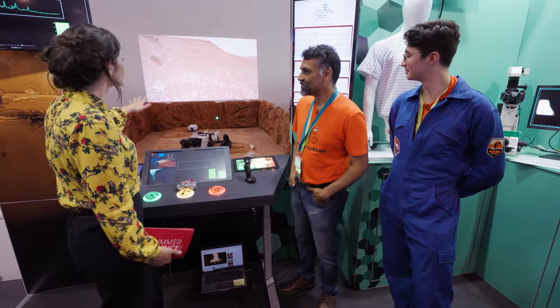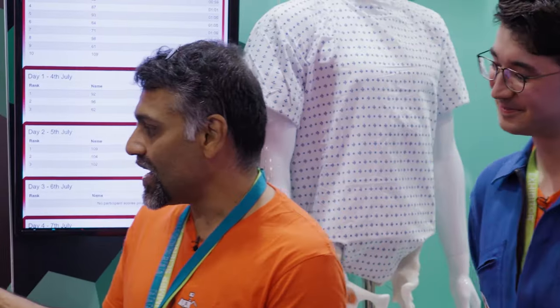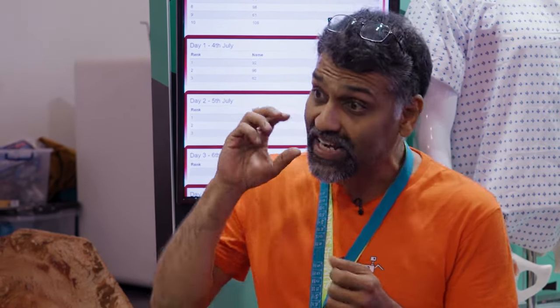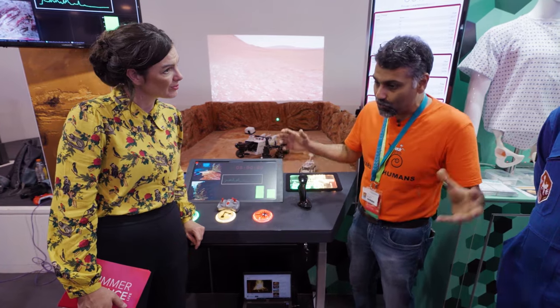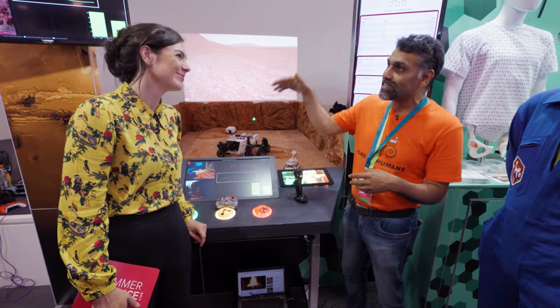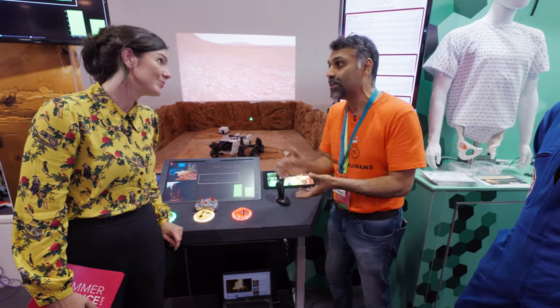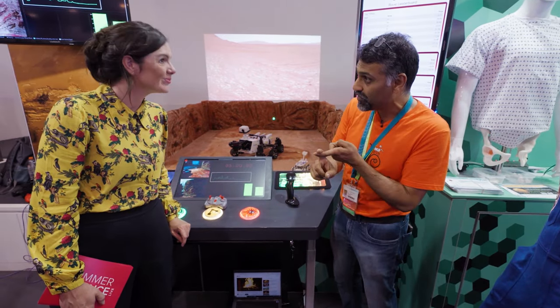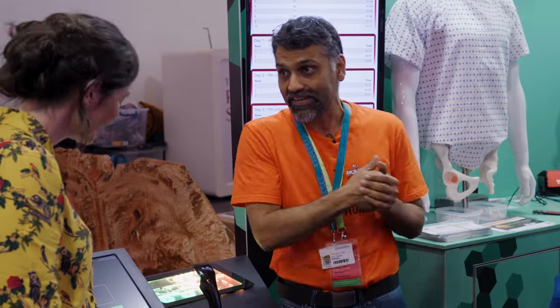So why have we got a slice of Mars right here, Sumit? Well, we've got a slice of Mars to explain the technology we're developing as part of the Enlighten Us program, a large collaboration between Nottingham, Edinburgh and Southampton, which is using a technology called Raman Spectroscopy. In Raman Spectroscopy, you shine a laser on a material and the molecules in the material start to vibrate. When they vibrate, they give off different colors. By recognizing the different colors, which is actually the chemical fingerprint, you can tell what the constitution of those chemicals are, whether they constitute life or they might be disease, which I'm going to talk about later.